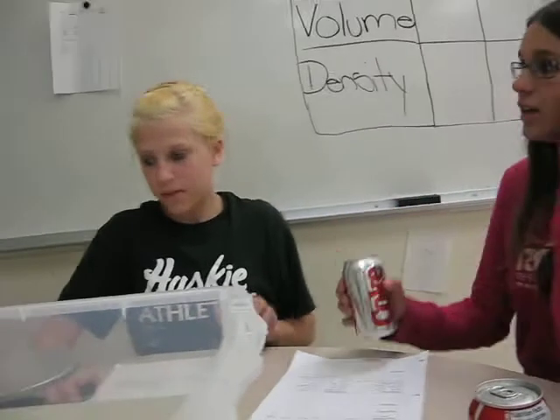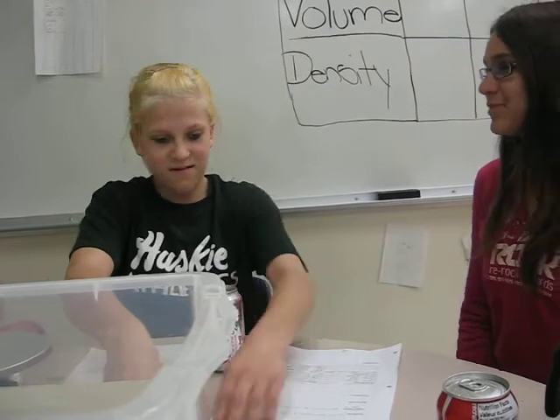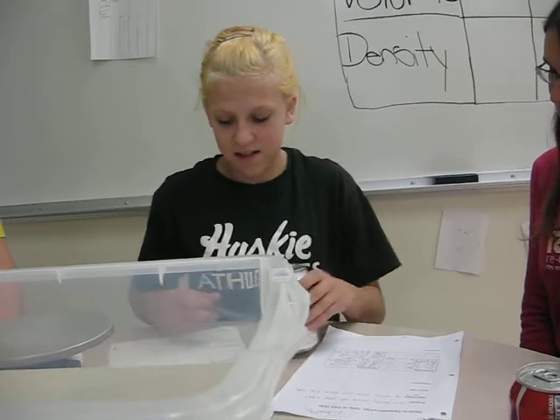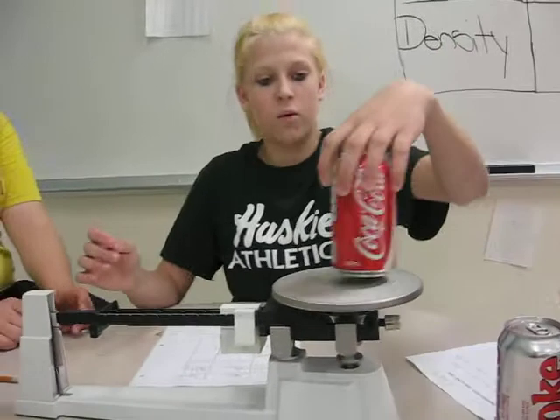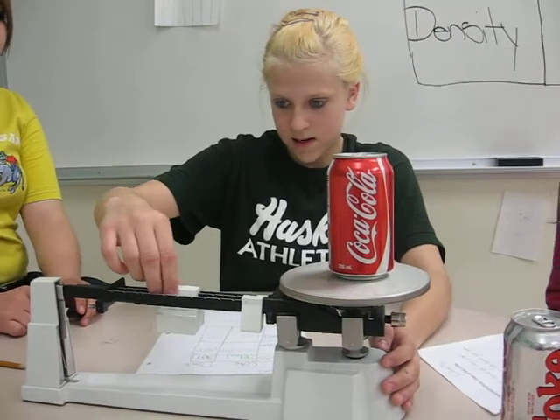Would you guys like to show me how you measure it? Sure. Brittany will do it for you. Okay, I'll show you how to do the mass, which would be — it's a triple beam scale. So first, we'll measure the Coke. Make sure it's at zero. Yes, it is at zero.